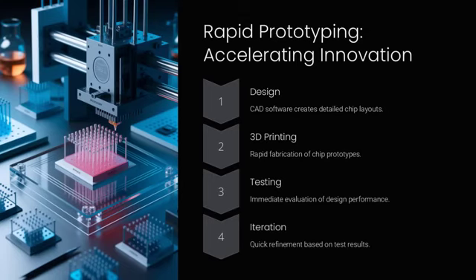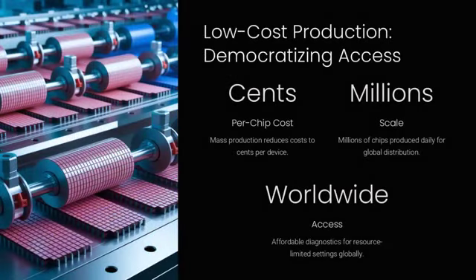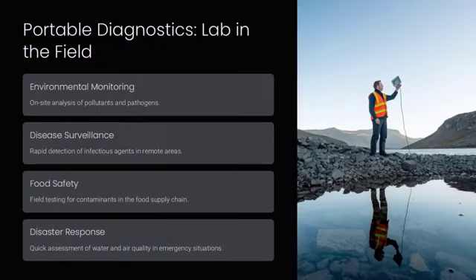Electrochemical sensors embedded in Lab-on-a-Chip platforms provide precise analyte detection by measuring electrical signals from chemical reactions. For example, a chip can detect trace pollutants by recording current changes, similar to a sensitive smoke detector that alerts at the slightest hint of smoke.